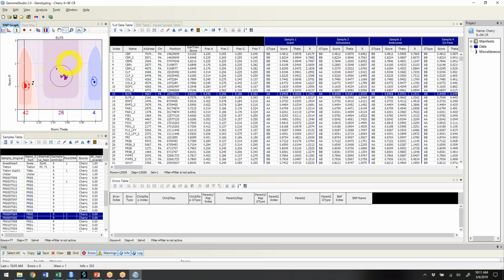So that one is really useful, especially when 2 clusters come close to each other and you can still identify them separate. You can still see the 2 clusters, but with the regular box where you have a box with straight lines, you would actually select a little bit of either cluster. If you do that with the lasso, you can really follow the contours of the clusters.